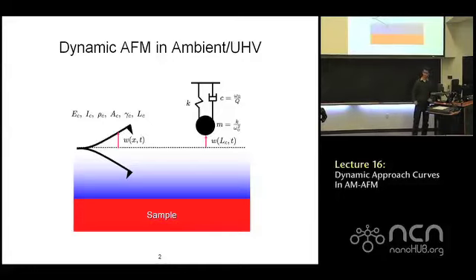It makes the program a little bit simpler if we can make those assumptions. Secondly, the point mass oscillator has a stiffness K, a damping coefficient C, and a mass M. But typically in the experimental observables, we write those in terms of the quality factor, which is given by this expression here, and the mass we'll write in terms of the natural frequency, omega 0, of the cantilever oscillating freely in space.